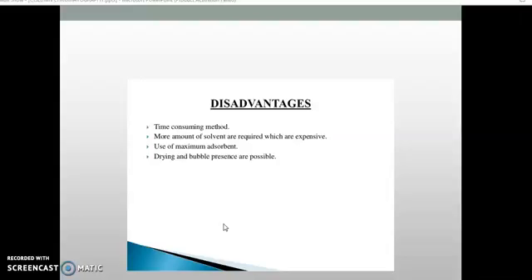The slurry consistency is very important to perform this column chromatography, so you need to handle the column very carefully. If you need more accuracy and more precision in your performance, and want minimal chances of manual errors, then in that condition you need to take more precautions.